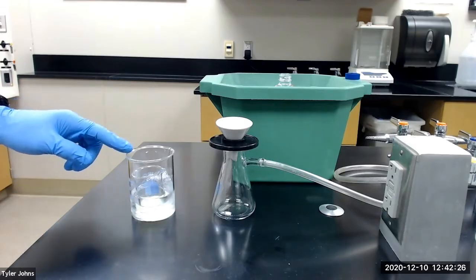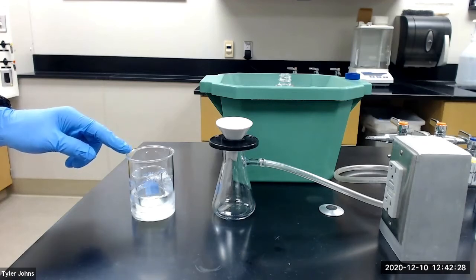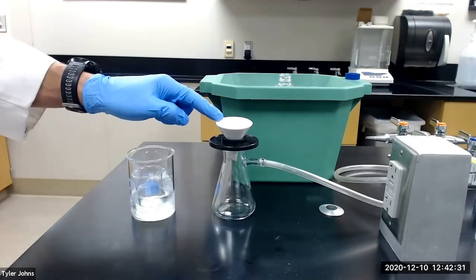After crystallization has completed, we will collect the crude benzil product by using vacuum filtration with a Hirsch funnel.